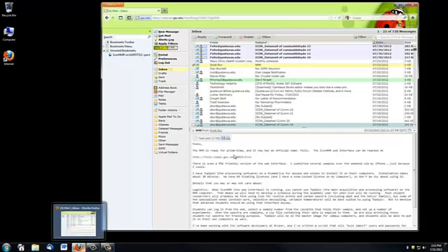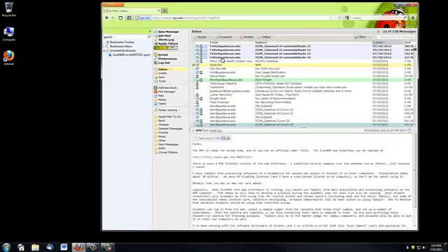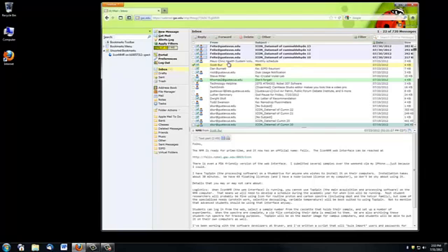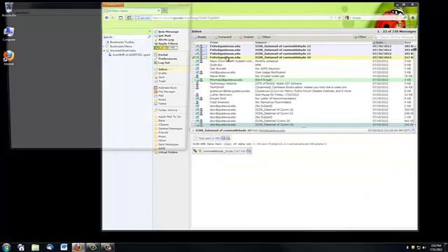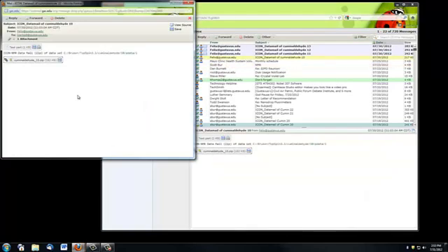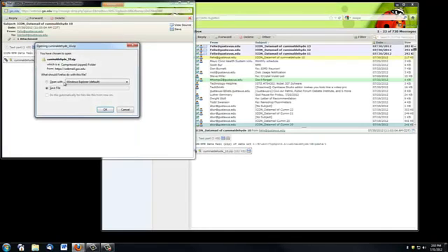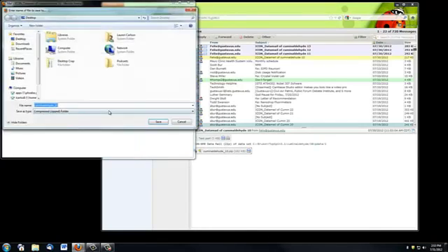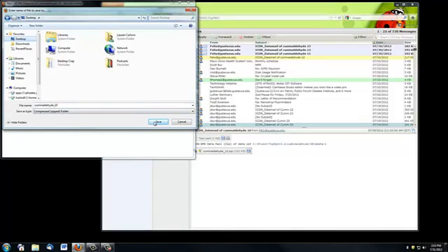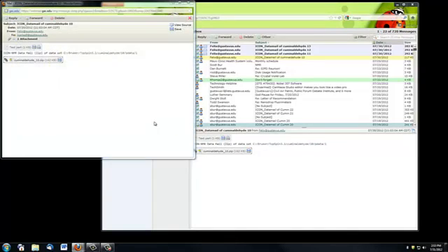When I open my email, I see that I have a series of messages from Felix at Gustavus.edu. These are automated messages sent from the NMR. If I click on this message here and save the file, I prefer to save these to the desktop so that they're easy to find later.